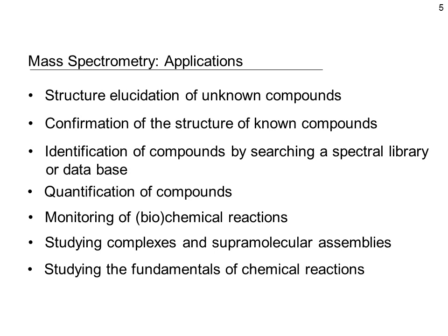A very important application for the bioanalysis is the quantification of compounds. In bioanalysis, we are generally not only interested in whether a compound is there or not, but we would like to know its concentration. To this end, we need to translate our signal from the mass spectrometer into a concentration, and this is done through the calibration with internal standards. More on the research side, the chemistry side, we can monitor reactions, either biochemical or chemical reactions. We can study the transformation of substrates to products by enzymes, but we could also study the fundamentals of chemical reactions in a mechanistic sense.